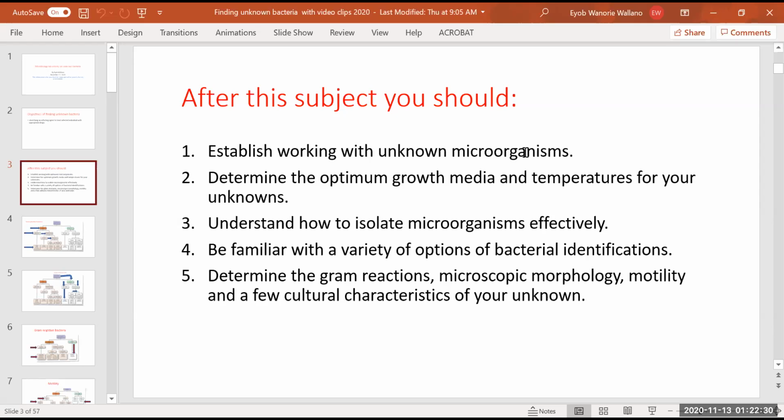For example, what are you going to use for catalase test? We are using hydrogen peroxide. Hydrolyzing sugars, what do we use? We are going to use iodine. You see, those kind of things, all we are going to focus for identification of microorganism, which we are going to find unknown bacteria. That is very important on microbiology, really. So here, for me, because I was practicing so many years, it is easy, but for you, it is not easy, really. Let me go over for you.